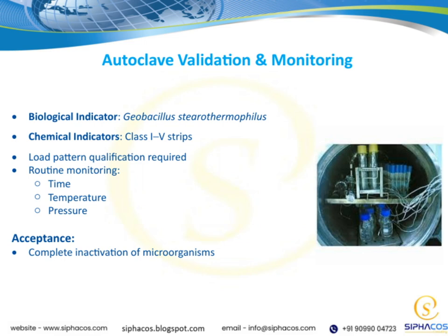And finally, the key acceptance criterion is complete inactivation of microorganisms. If our biological indicators show that all microorganisms have been destroyed, then we can confidently say our sterilization process is successful. This ensures patient safety and compliance with quality standards.